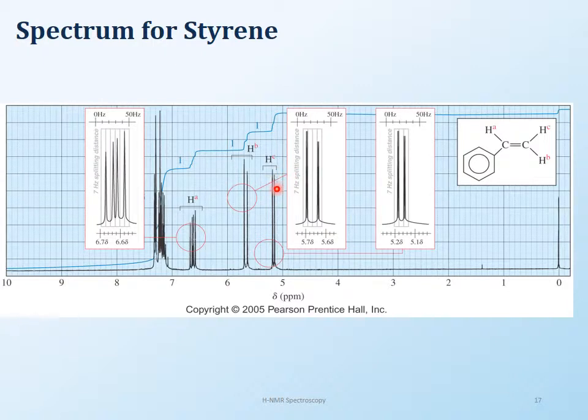The C protons, if you look at them, which is over here, I hope you can see it, it is still splitting even more. So when C looks at A, it looks at a doublet. When C looks at B, it's looking at 1 proton, so that's a doublet. Which means you have a doublet and a doublet. But they're not that far away from each other, so the doublets are kind of overlapping. If you look closely enough, you will see the doublets.